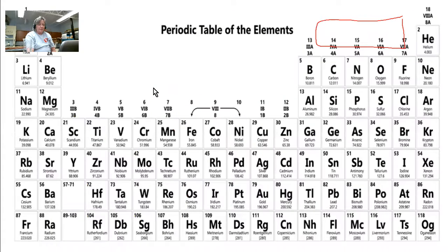So if we flip over and look at the periodic table, I've got to find magnesium, sulfur, and oxygen, and look up the atomic masses. Well, magnesium, here it is, number 12 on the periodic table. Magnesium has an atomic mass of 24.305. Well, that's the number I'm going to use. If I had magnesium and I could mass out 24.305 grams, I would have a mole of magnesium.